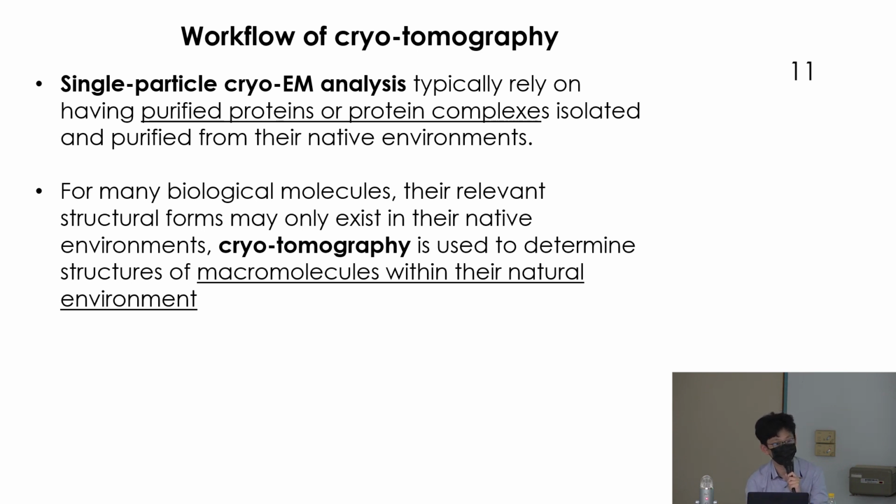But what if your sample cannot be purified? Then you will have to use cryotomography. This is usually used on some unique samples, where you want to understand how, let's say, the nuclear pore or this organelle deals with its neighboring environment. How does it interact with other organelles? In this case, you will have to use cryotomography. You cannot just purify your subject.